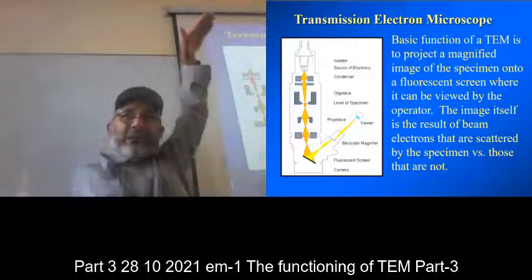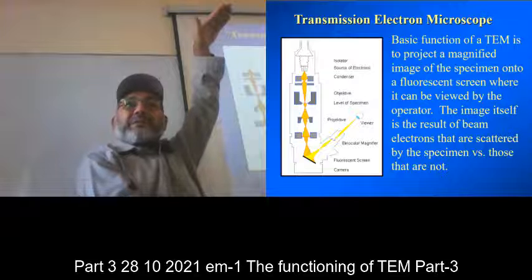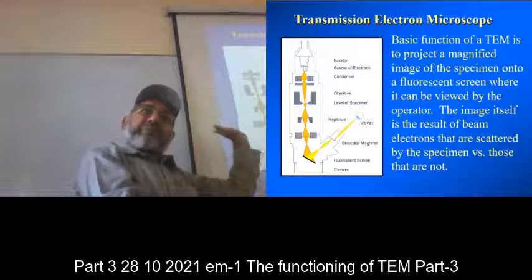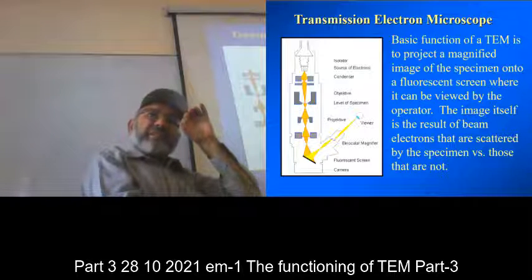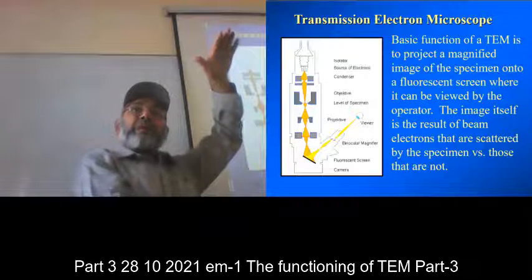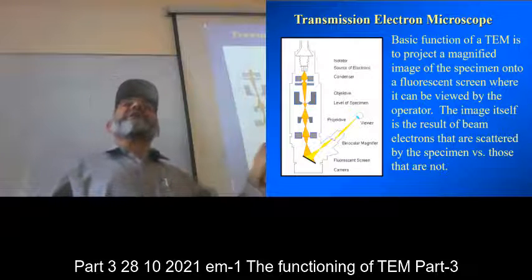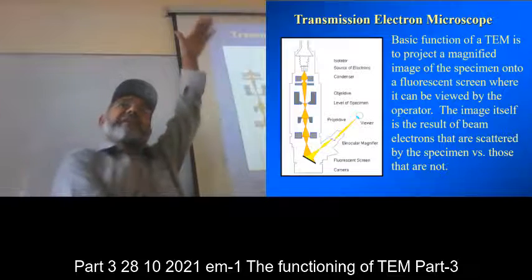So from here to here, you have a choice of 100 times magnification. So the 1 million magnification, because you are not taking the image with the eyepieces, right? So the 1 million magnification was there, and when you enlarge the negative, then you converted it into 100 million times. And here you have a great choice.